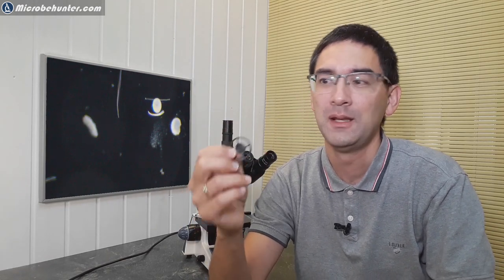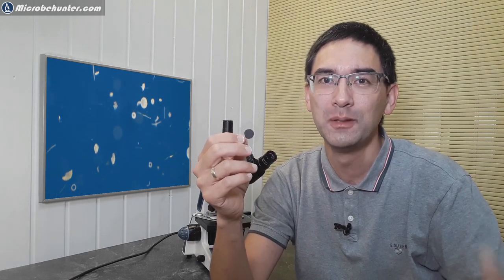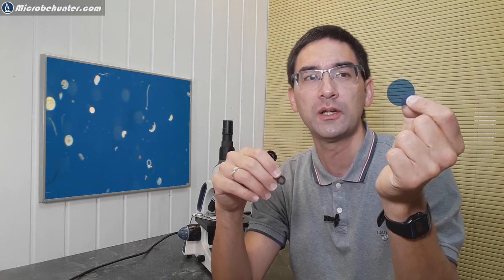So if you want to make those filters yourself, it's really easy to do. Now, I 3D printed these here, but I know that most of you don't have a 3D printer. And it's also not necessary. So what I recommend is that you use a clear plastic, from, I don't know, packaging material. And in the center here, you can glue a black piece of paper. And what is important is, of course, the outside dimensions. That's 32 millimeters for this microscope here. You can measure it out yourself using the supplied blue filter that usually comes along.